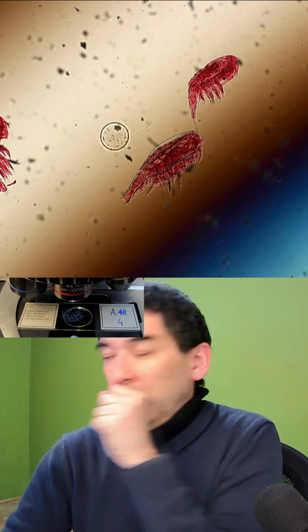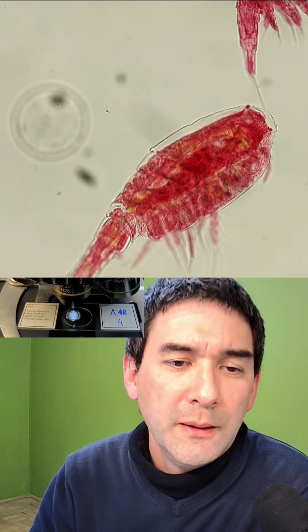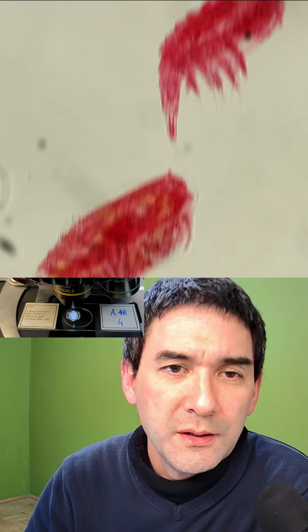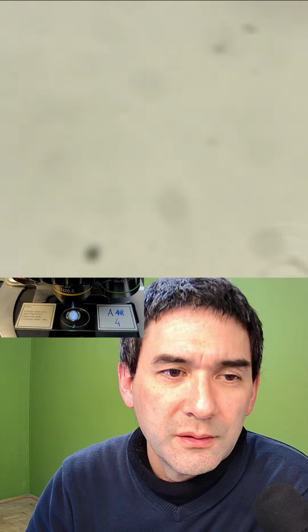Excuse me, I've got a cough. I guess I just go bright field here. These are basically just what appear to be stained specimens. Where's the other one? There were other ones here as well.